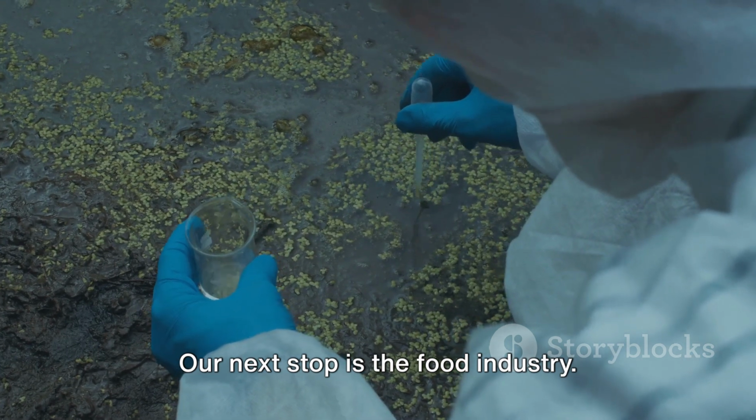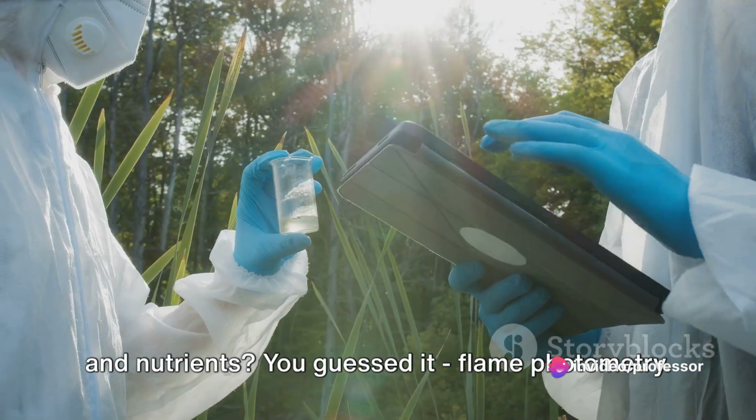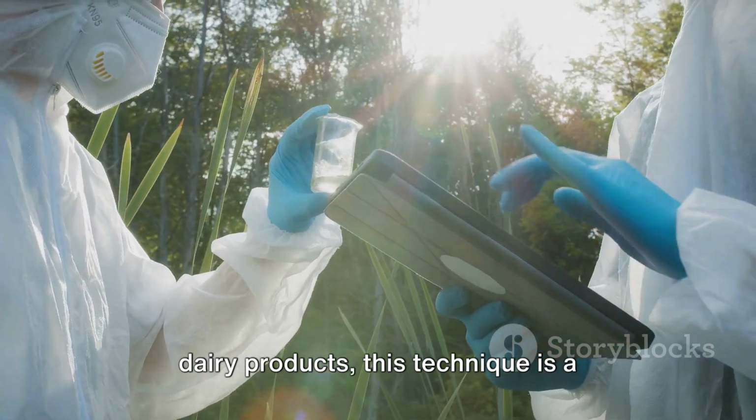Our next stop is the food industry. Ever wondered how companies ensure their products have the right amount of minerals and nutrients? You guessed it, flame photometry. From checking the sodium content in potato chips to measuring the calcium in dairy products, this technique is a mainstay in food quality control.